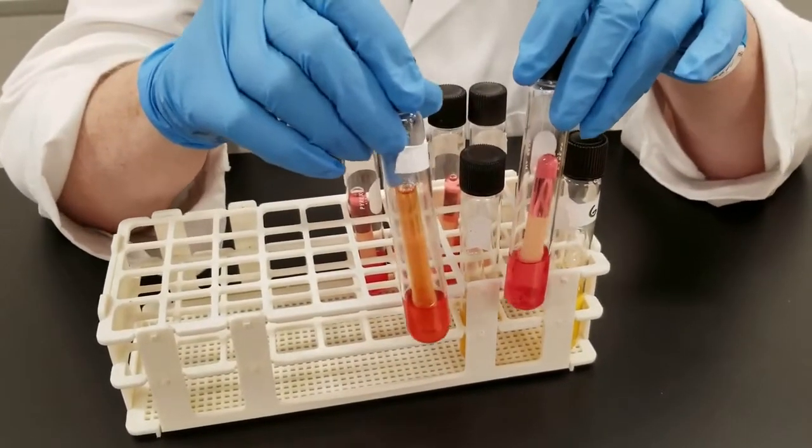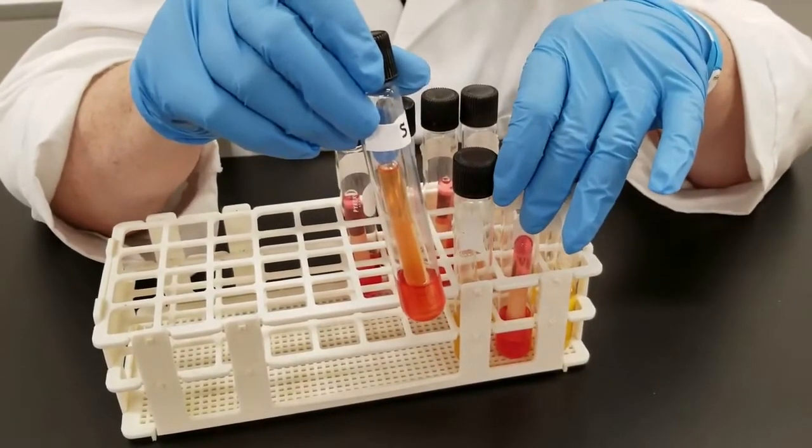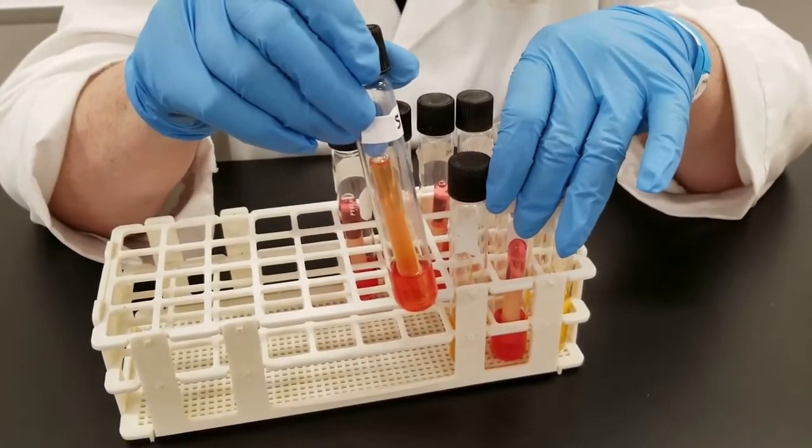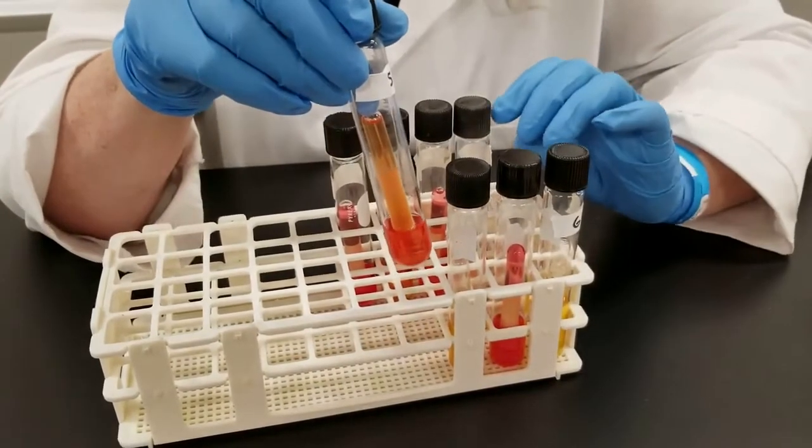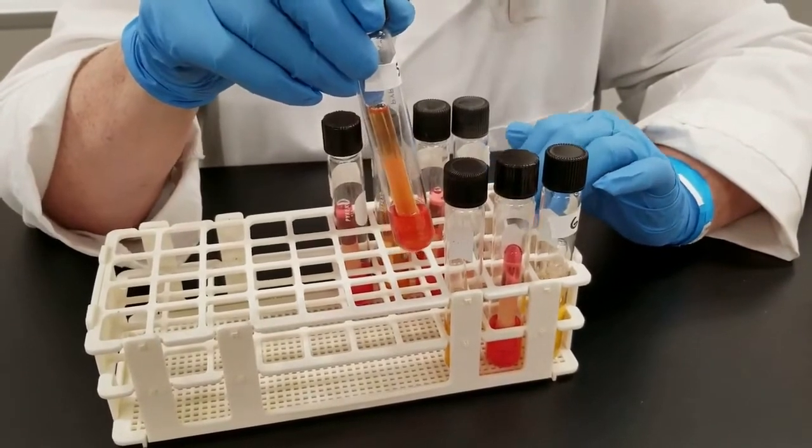Now in this tube over here, if you look at the inverted tube, it is yellow inside there. So the organism has just started growing. Once again, this is E. coli. So you're starting to get some acid production, but no gas.